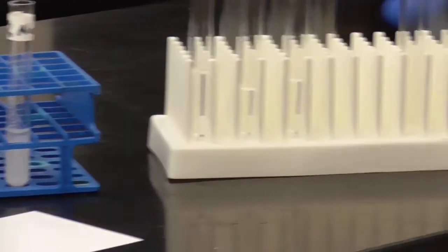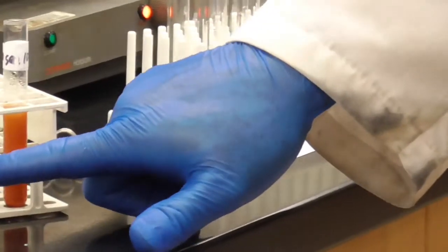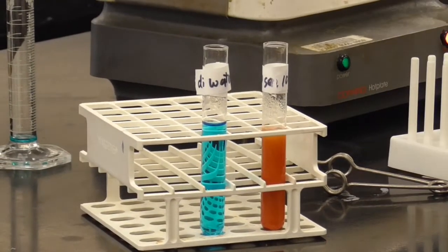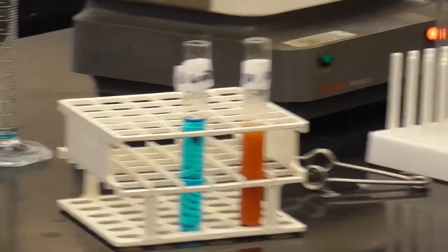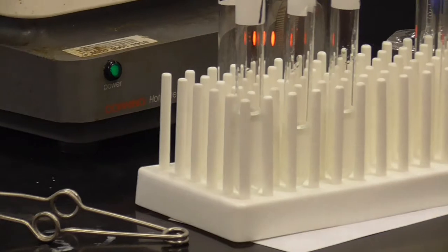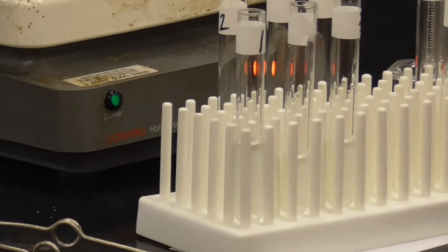Very good. Next station, we test for glucose. And you remember, this is what the negative looks like, this is what the positive looks like. We add 3 milliliters of Benedict's reagent, and then we heat it up for 3 to 5 minutes. So let me get my 3 milliliters here.